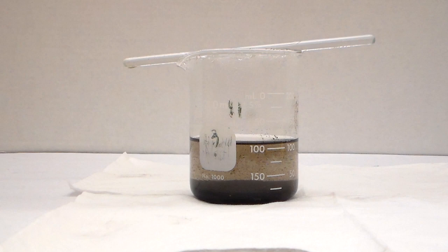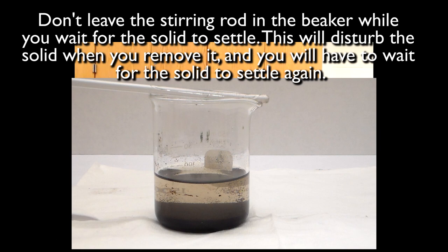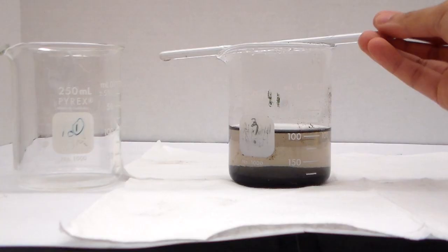First, let the solid settle to the bottom. It might help to put a white paper underneath to see the separation more clearly. Also, do not leave the stirring rod inside the beaker, otherwise this will disturb the solid.